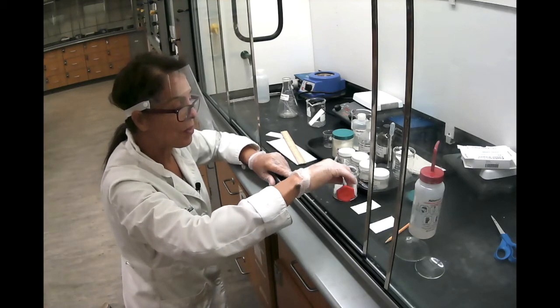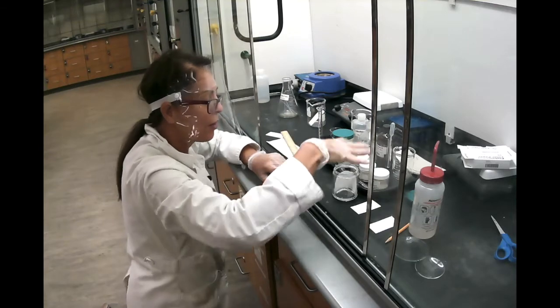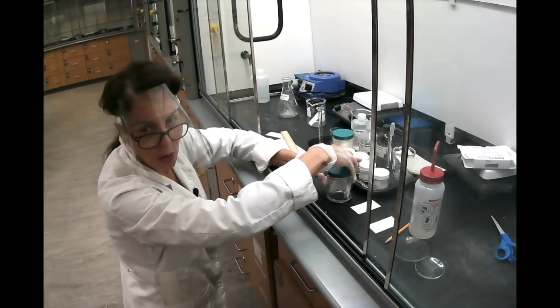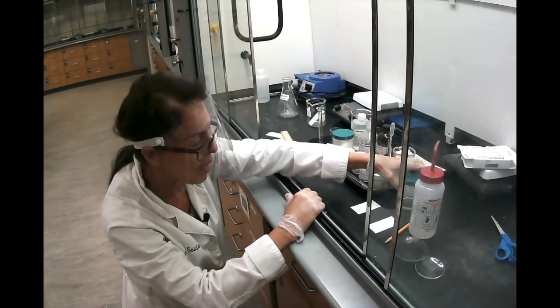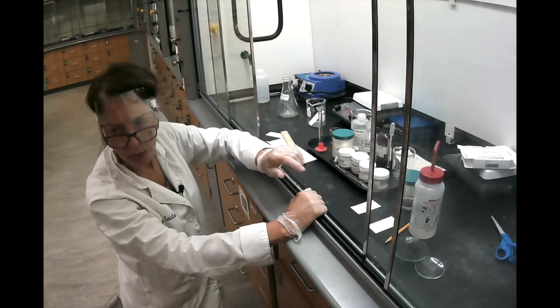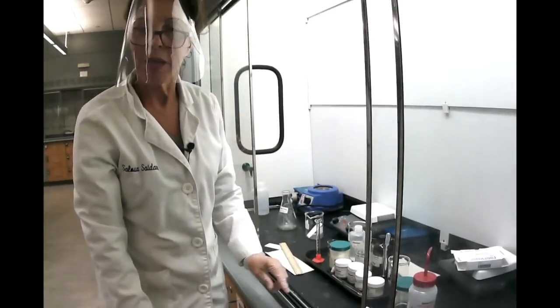Now I'm going to transfer the liquid into the jar and allow the filter paper to absorb some of that liquid to saturate this environment. So I'm going to keep it aside while I spot the substances on my TLC plate.